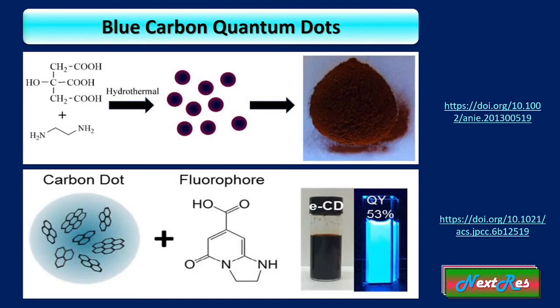I will not tell that this is the only way and precursor for preparation of carbon quantum dots. But among thousands of other precursors this is a very common one and highly effective in producing a high quantum yield.